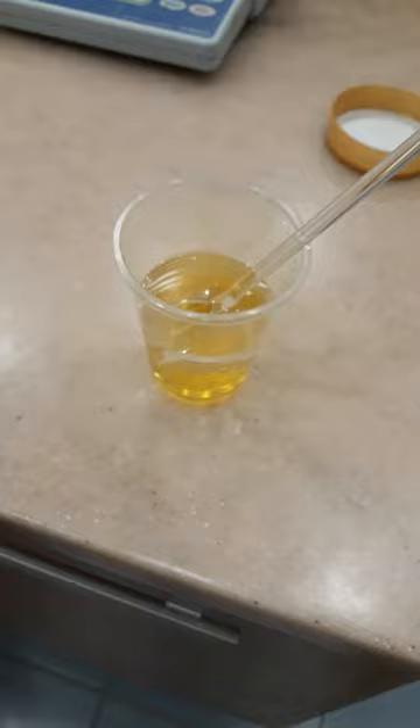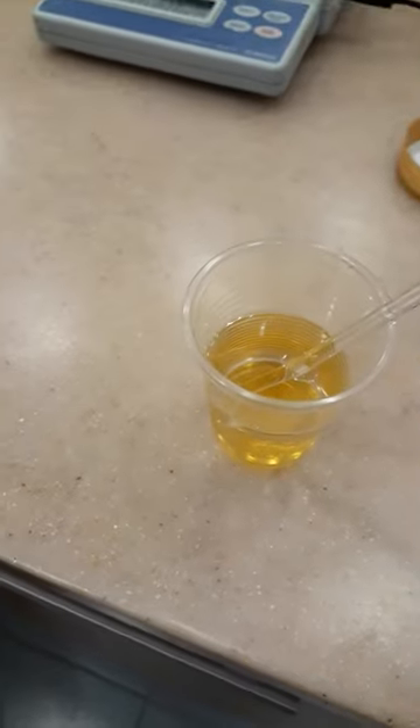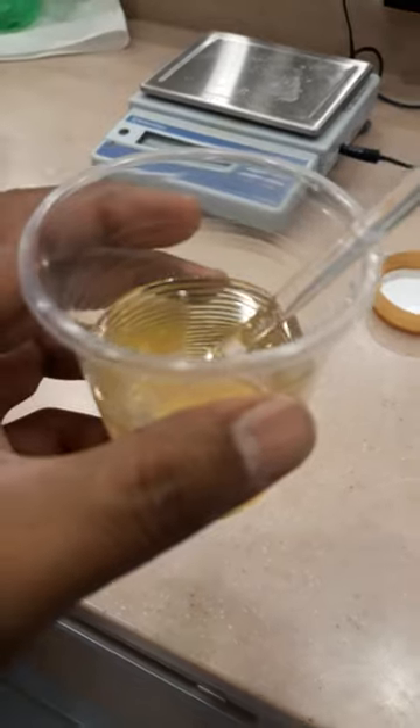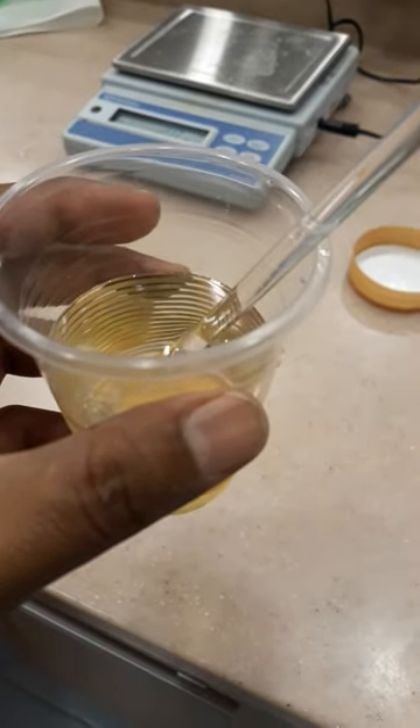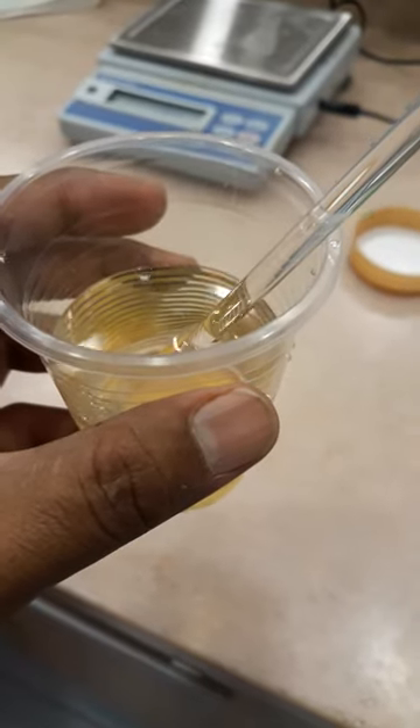I have already added 75 ml of distilled water to the sample. After dissolving the honey into the distilled water, I will check the pH using a pH meter.